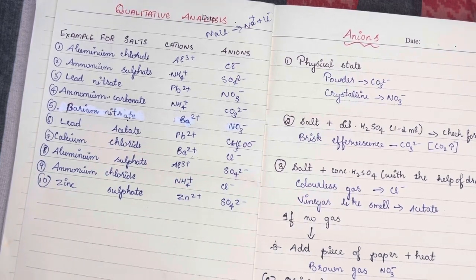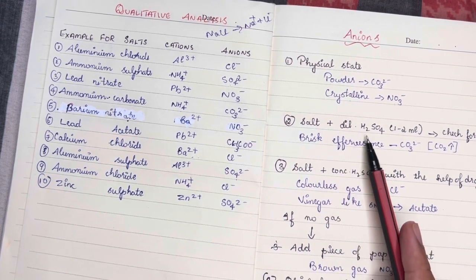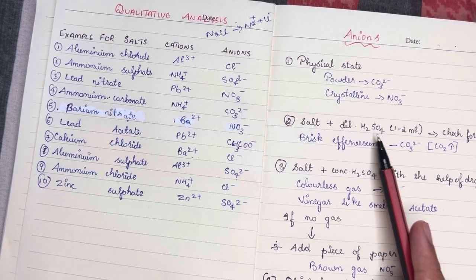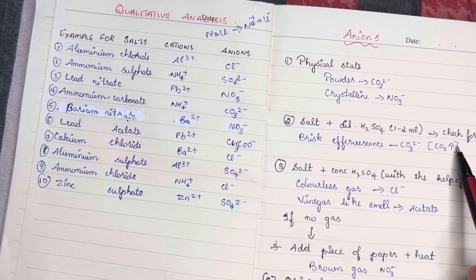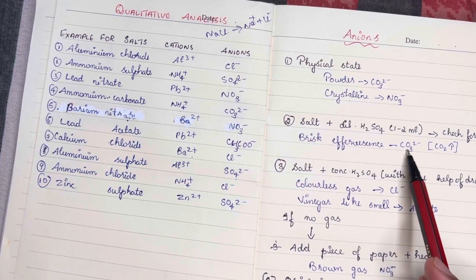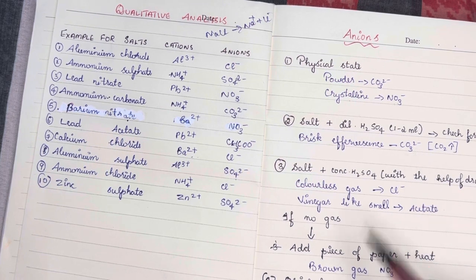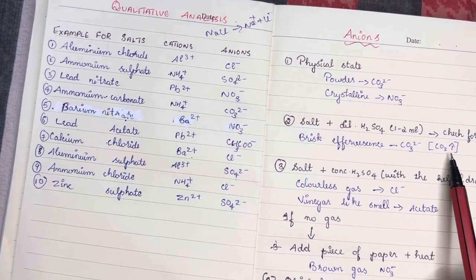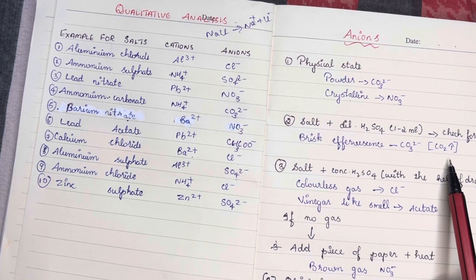After that, you have to go on for the experiments. To the given salt, add 1 to 2 ml of dilute sulfuric acid and check for the gas. If the gas gives brisk effervescence, it means carbonate is present. So CO3 2 minus, carbonate, is present, and the gas evolved because of the brisk effervescence is carbon dioxide gas. And if there is no brisk effervescence, then the carbonate is absent.